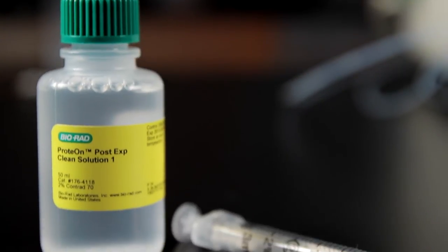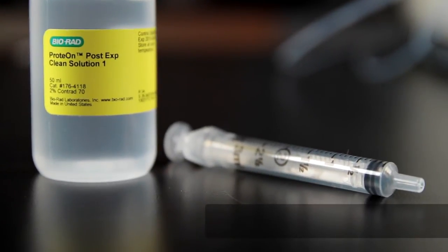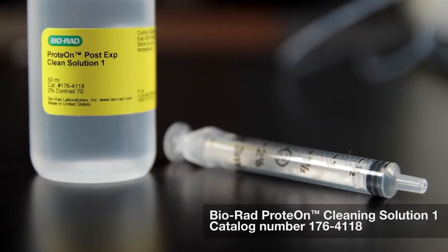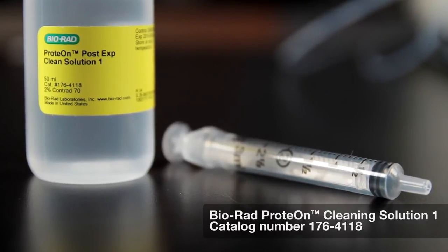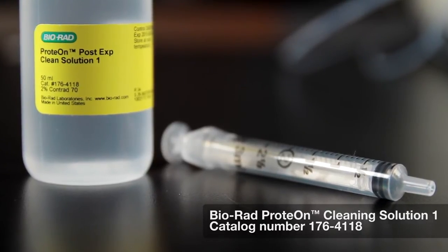If you see any cracks in the flow cell, you should replace the flow cell before proceeding. Prepare a solution of 2% Contrad detergent or use Bio-Rad Proteon Cleaning Solution 1, which is catalog number 176-4118.